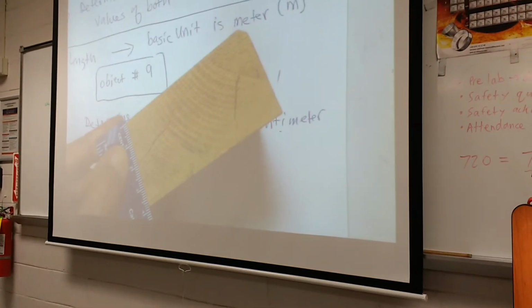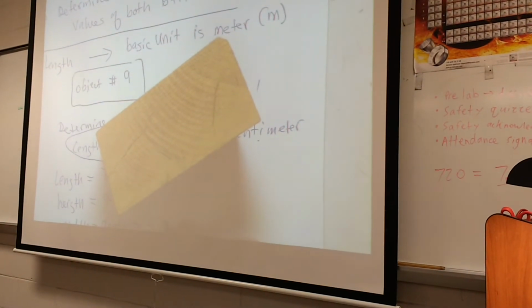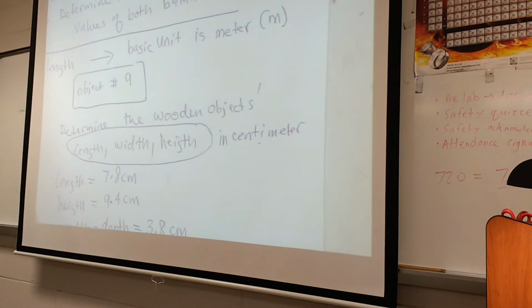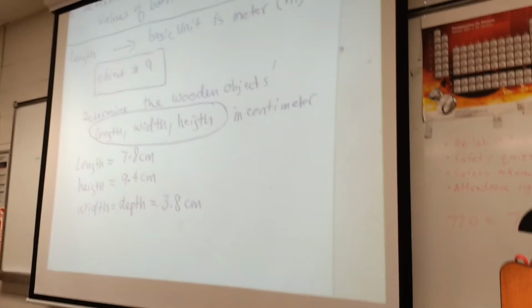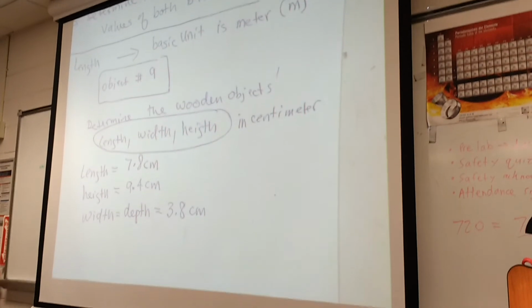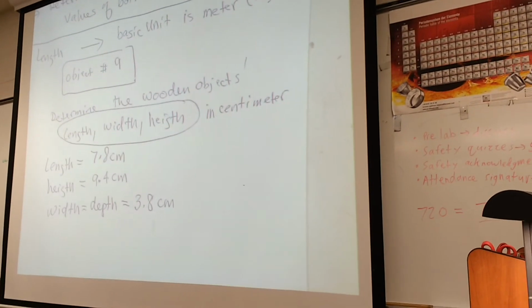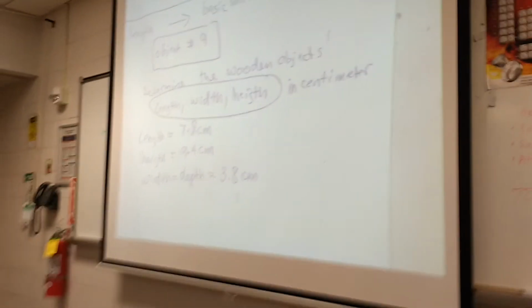I would say maybe 8.5. 3.9. So 3.8 centimeters. You can see it's very difficult to get an accurate measurement using this ruler.